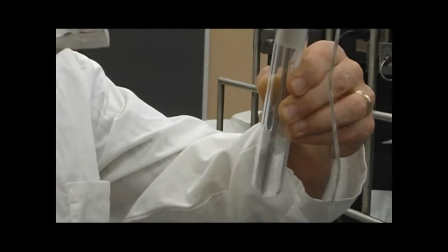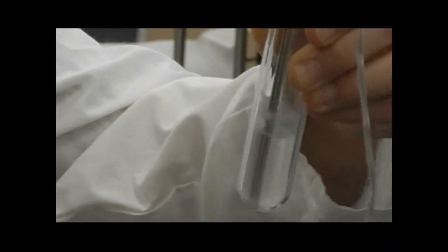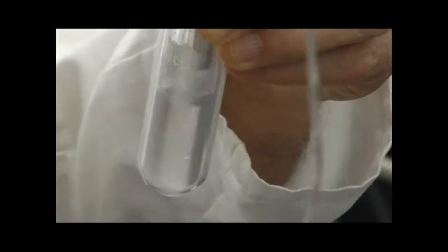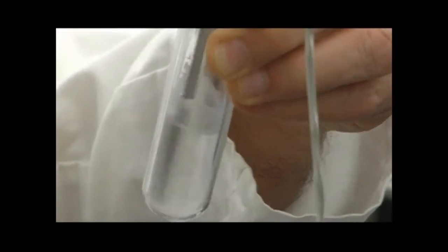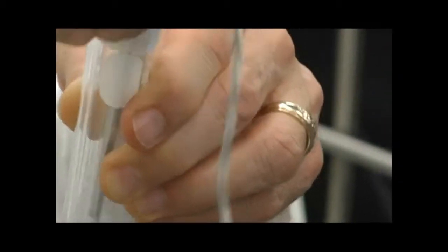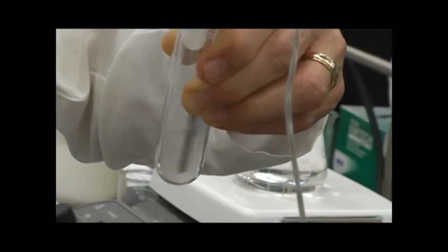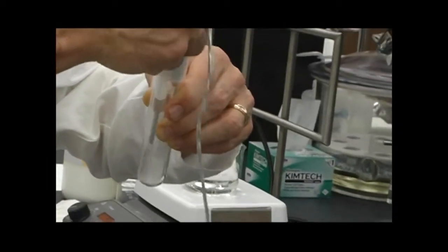So if I stir it properly, it will never get solid freezing. The energy of stirring will melt and some will freeze. At some point in time, I won't be able to overcome the coolness, but you can see that it's at 43.5 and it's been there for about a minute and a half.